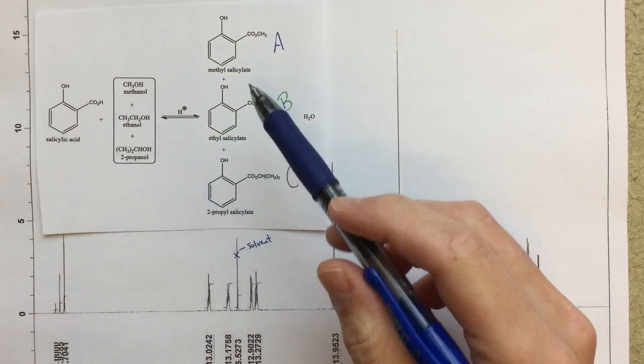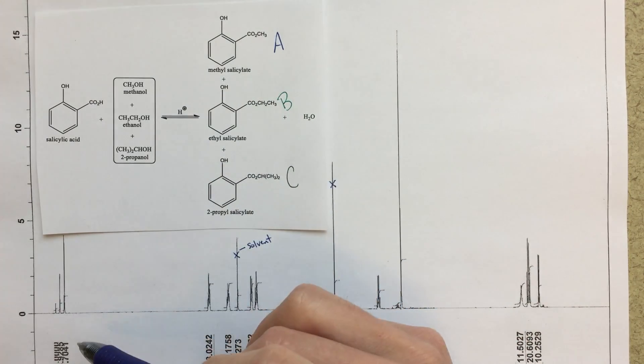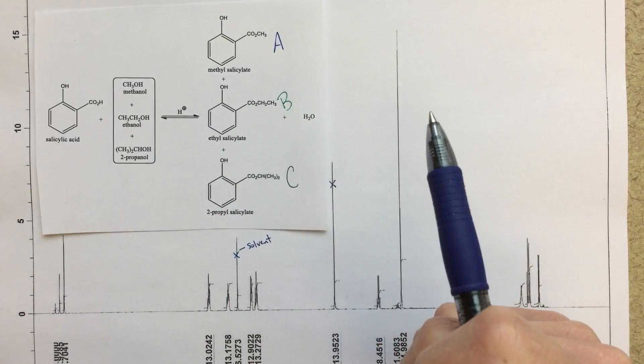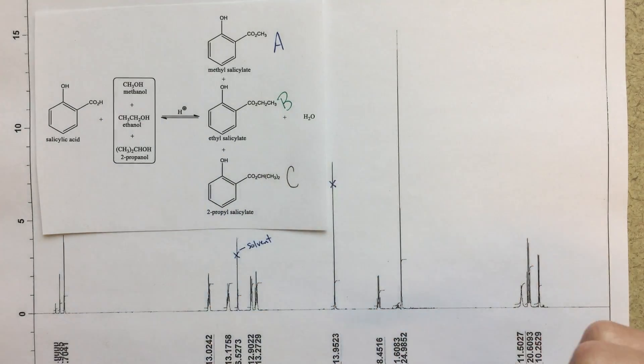Now, it's really hard for us to tell from this point which one is which, right? So we're not going to be able to do that yet. But once we do, once we figure out which one of these is A, B, and C, then we can use the integrations to figure out what the relative percentages are.